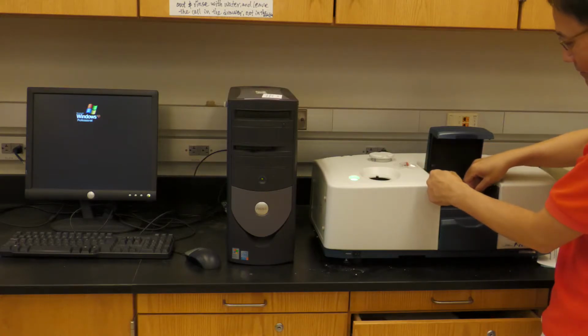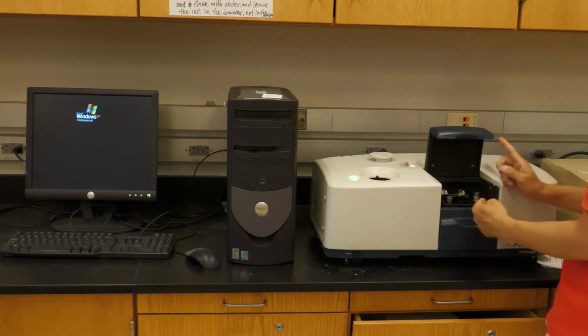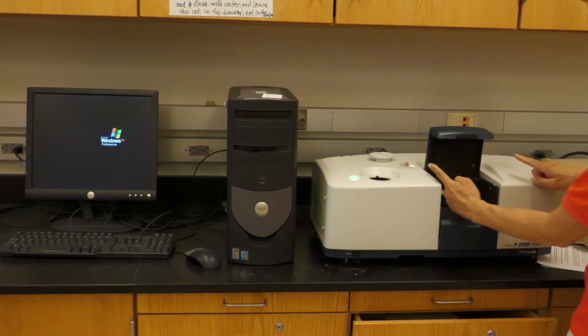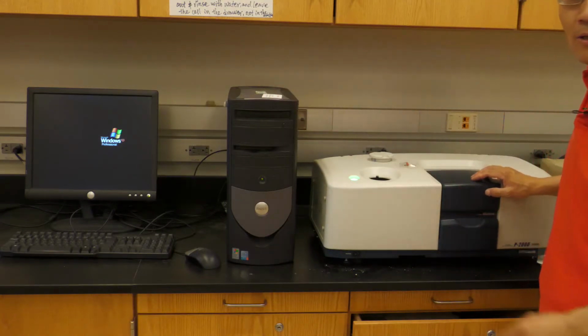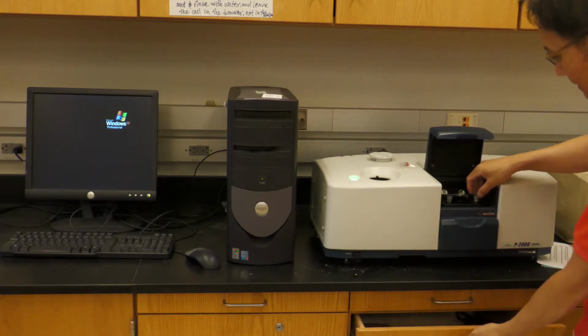Then the light goes through here. After they go through the chemicals, they will change the angle. They measure the relative angle change between before and after. Then they will send this signal to the computer to record the angle change. That is a general idea of this experiment.